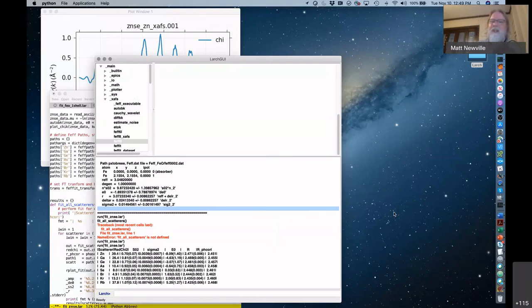I've given talks about wavelet analysis, and there are things, especially when there's multiple scattering or peaks overlapping, where things don't look quite linear in the wavelet analyses.